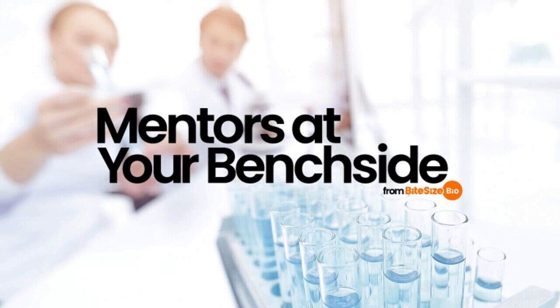Number 5, omitting the secondary antibody control. Samples like brain, lungs and colon cells, those rich in elastin, collagen and lipofuscin, tend to be high in autofluorescence. Omitting the secondary antibody helps determine if the observed fluorescence is coming from background autofluorescence. If you find that you're getting autofluorescence, don't worry, there are some things you can do to reduce it. Check out a corresponding online article for a link to that resource.